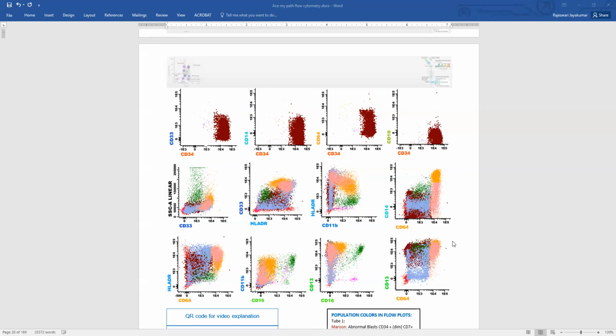So basically, you have to remember that it will be like a myelomonocytic leukemia, and you will see a spectrum of population here in the monocytic and myeloid lineage. So when you sign out this case, obviously from flow cytometry, you cannot say that this is AML with inversion 16. Obviously, you need your FISH studies for that.